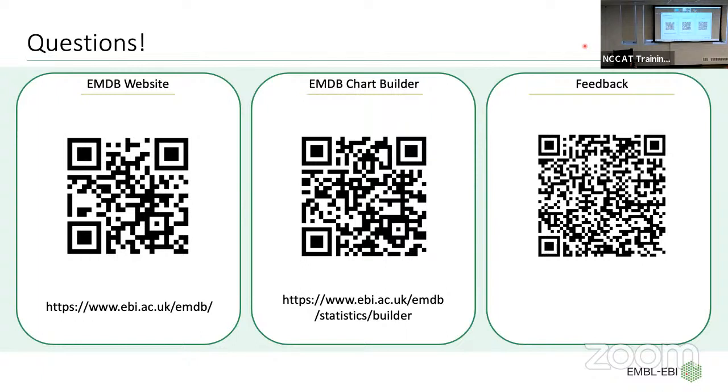I noticed, at least for some of the tutorials I learned, you have to provide some kind of rough rotation of the axis, or the size of the fiducials if they do have them. Obviously they don't provide this in the publication, and then you almost always have to ask the author about such details.